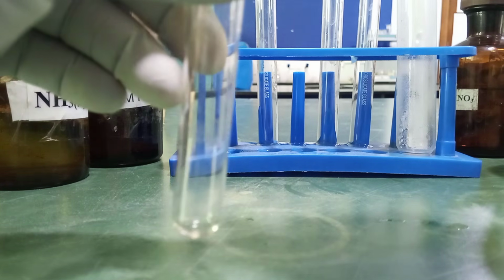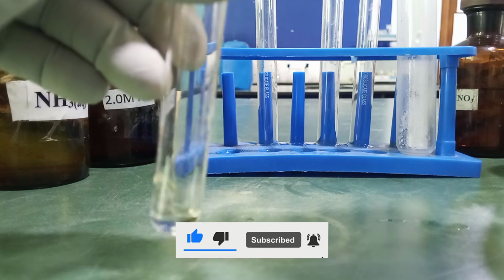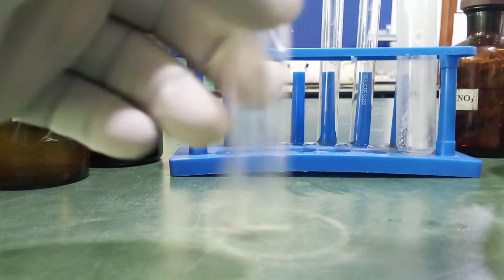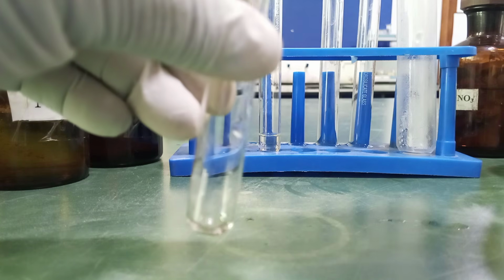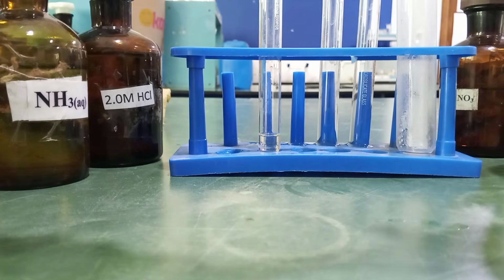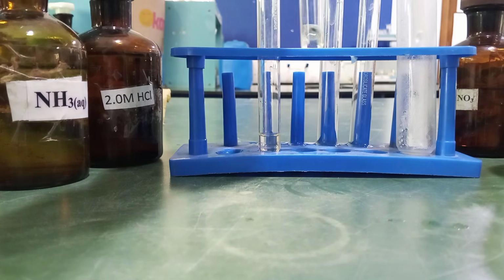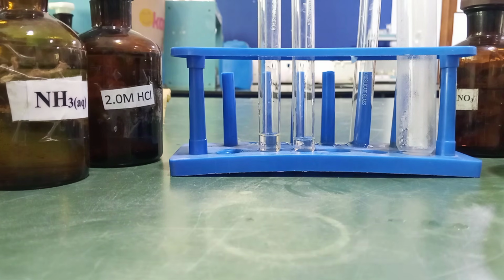So first off, we'll divide this into three different portions. 1, 2, just little portions, and then 3.